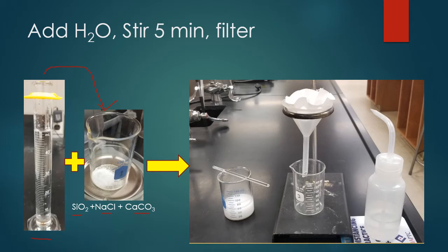Stir for about five minutes and then let it sit. The reason we're adding the water and stirring is because we're trying to get one of the compounds in the mixture to dissolve. One of those three compounds is soluble in water and the other two are not. By stirring it around, we're ensuring that we're getting all of the compound that we want dissolved. Once we're done stirring, we let the beaker sit. We let the solids that are still present, the two compounds that were insoluble in water, settle to the bottom so that we can decant the liquid into the gravity filtration setup.